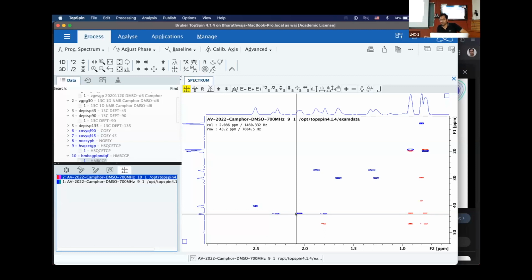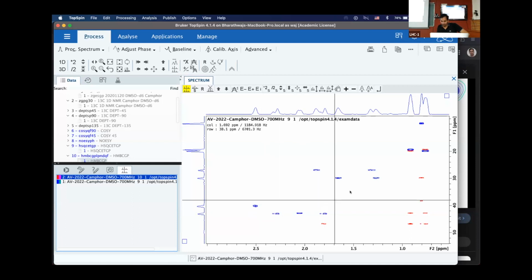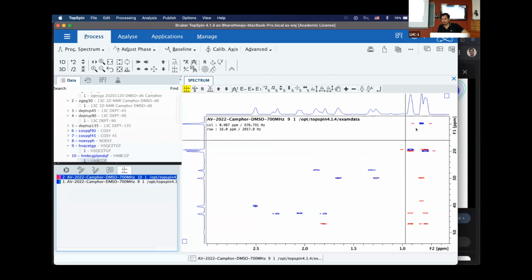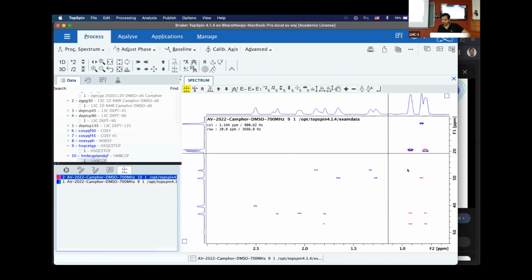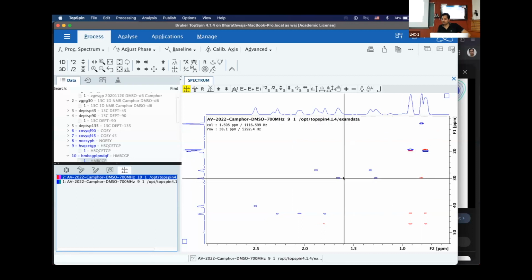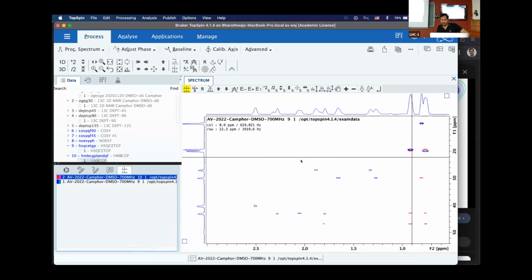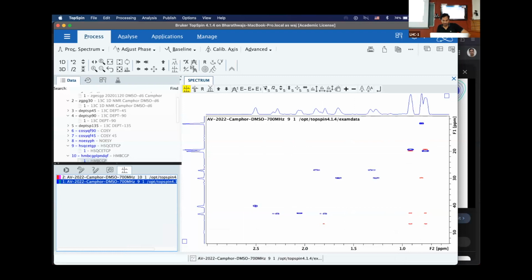Look at how an HMBC experiment works. So for instance, I'll take one example of this. Take this methyl group. You do not know where it falls, but now you're able to see that that methyl group talks to only one CH2 group. Why? Because this is a CH2 carbon. This is a methyl group, isn't it? And you're able to see that one ends up discussing with this one. So let's go take a look at the chemical structure. And why am I not taking these? Because you are also able to appreciate the fact these two methyl groups have something that comes up that's not present in a HSQC.